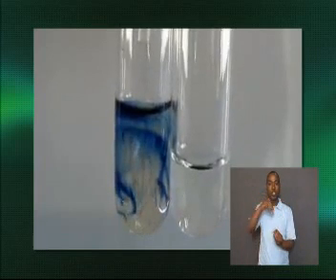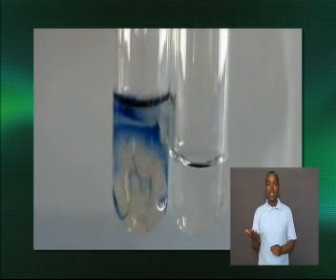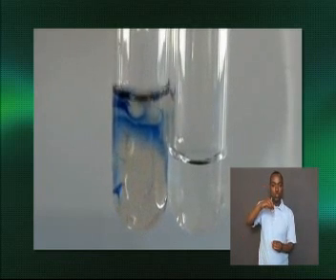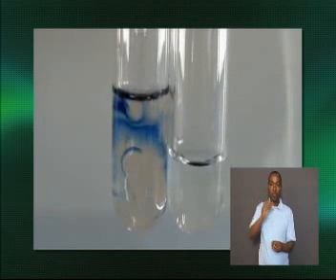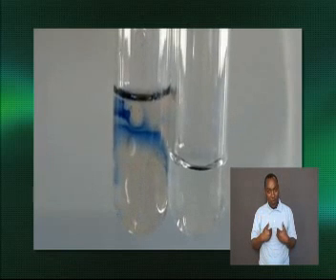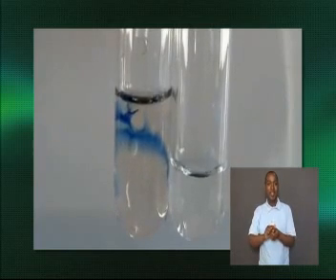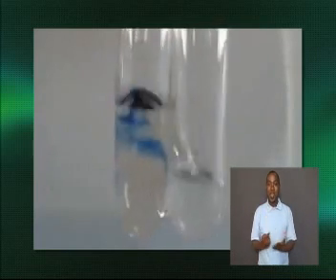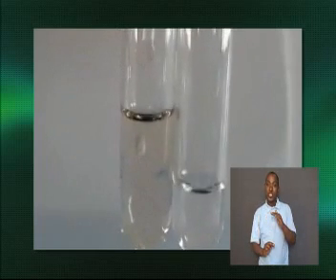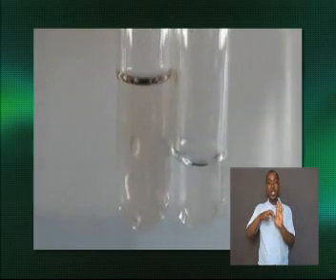Then, using a dropper, the substance that is tested is added drop by drop into the test tube. If the substance contains vitamin C, a gradual fading of color will occur. This is because vitamin C has a reducing action on the DCPIP reagent, which makes it lose its color.